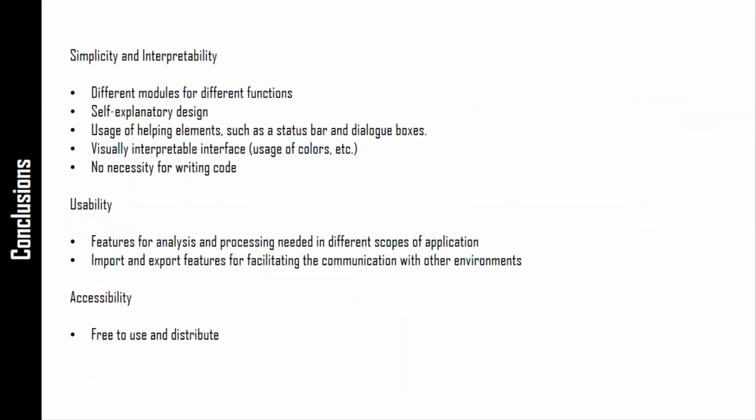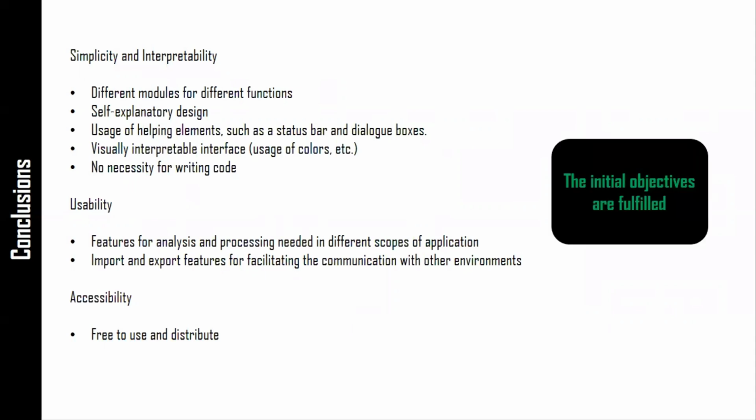As a conclusion, we could say that with simplicity and interpretability, by increasing usability, and by making this application available for free and increasing the accessibility, we could reach our initial goals. And so we could say that the initial objectives are fulfilled.